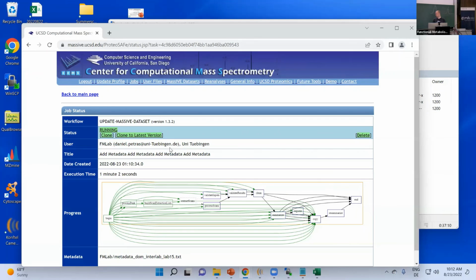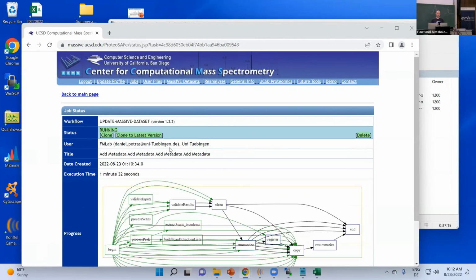But yeah, cool. All right. There's a question online asking if you can share some screenshots about MZmine convert, because she missed the first 30 minutes, but found your own video about it on YouTube. Yeah, there's a lot of material. Also in the GNPS documentation, there's a lot of info, and we will make this recording from the summer school available, so they can just watch that.